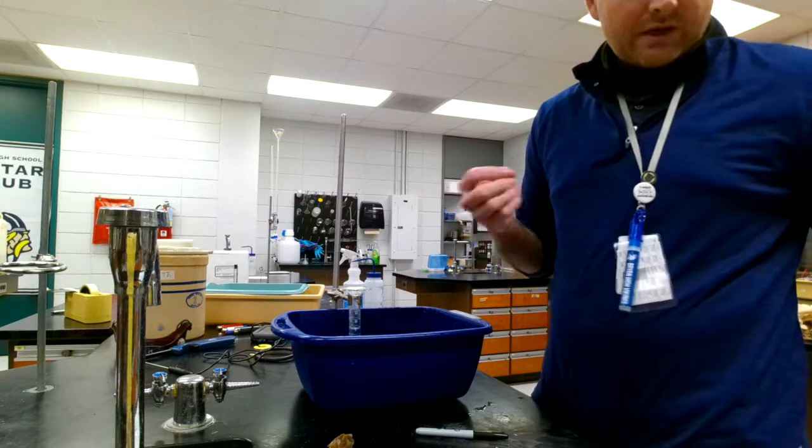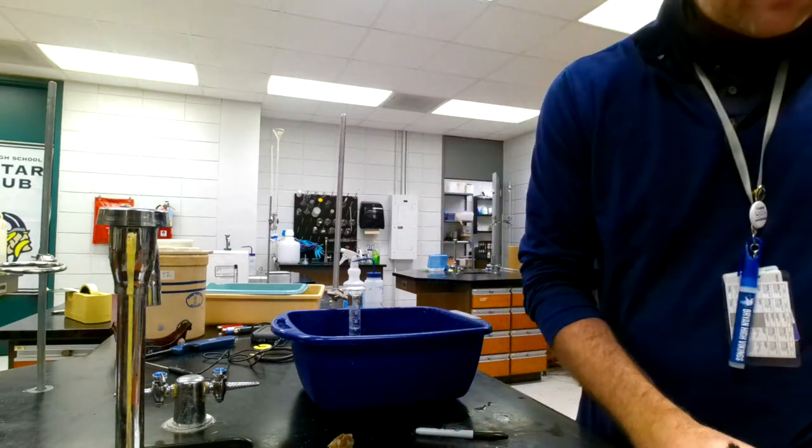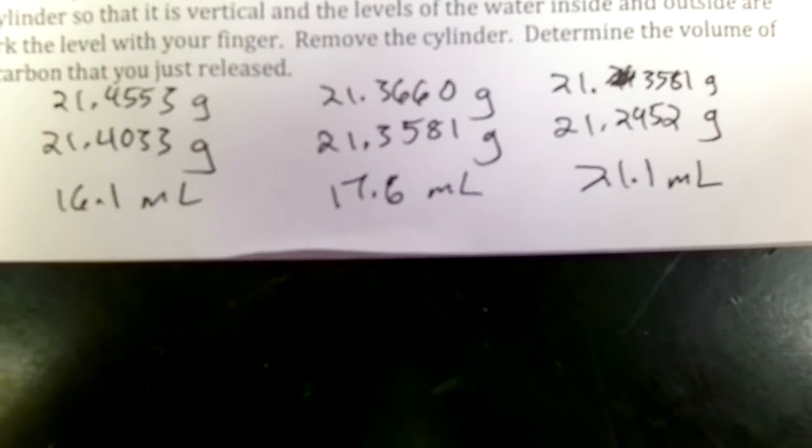So we have 3 relatively good trials. That first one was garbage. Let's throw that first one out. I'll give you a hint. Take a look at that data table right there. That should square you away.